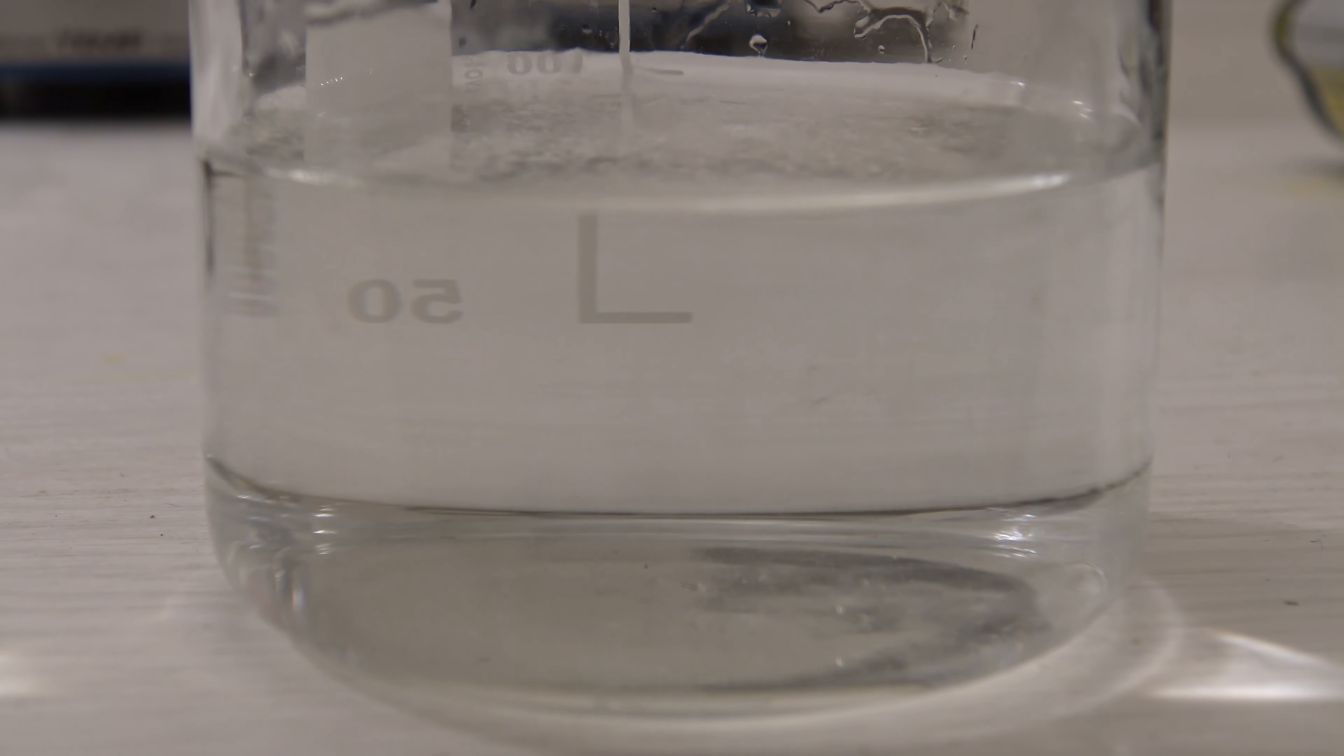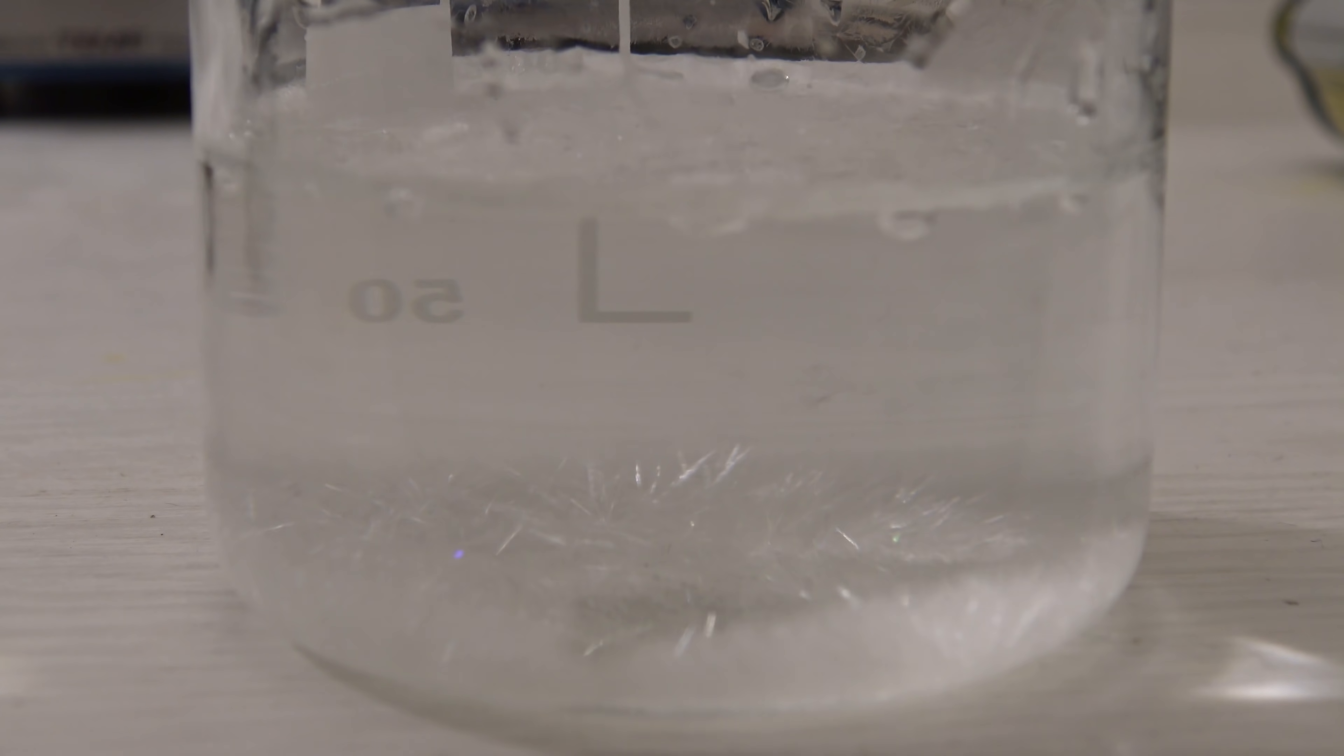When it cooled down, it could be seen that it's good that the beaker is covered. Above the solution, small crystals could be observed, which would otherwise spread around the beaker. Benzoic acid forms colorless needle-shaped crystals, as it can be seen here.